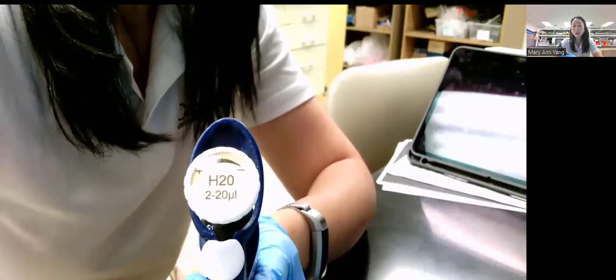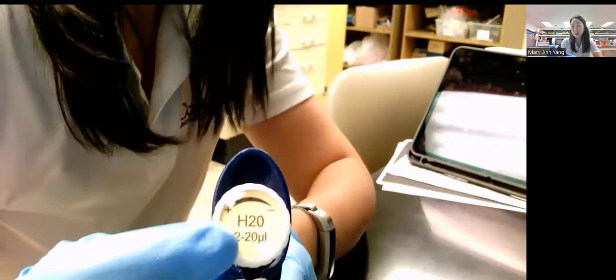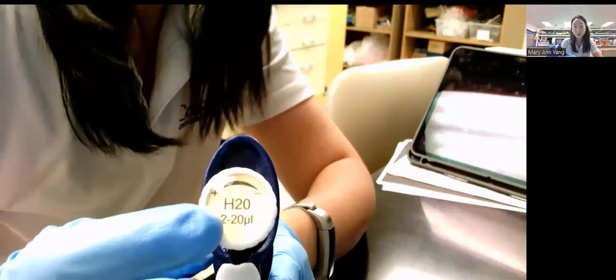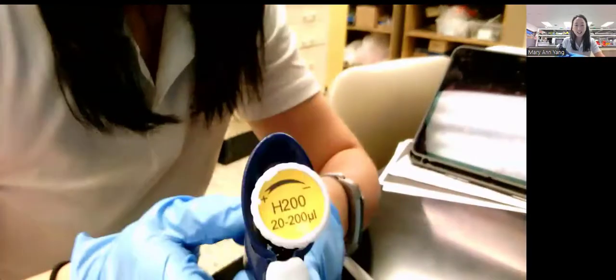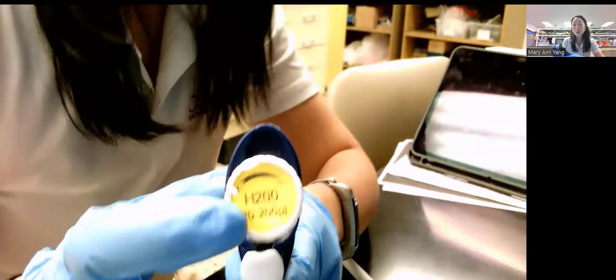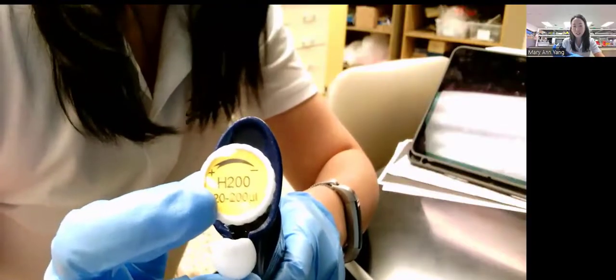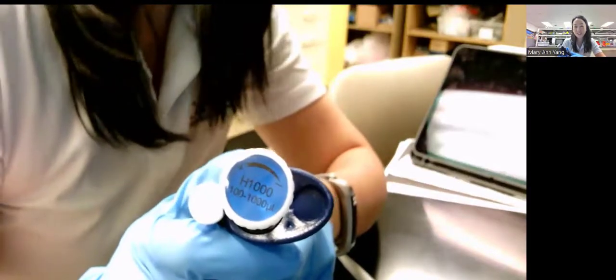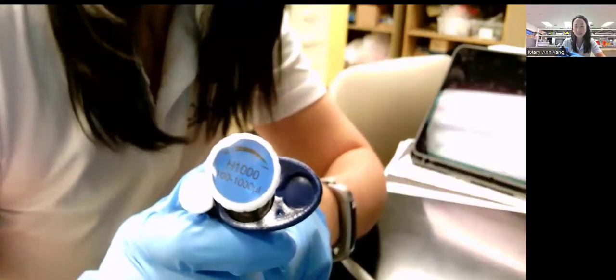So you either have the P20, for pipette 20, or you're going to have the P200, for pipette 200, or you're going to have the P1000, as we call it, for pipette 1000.